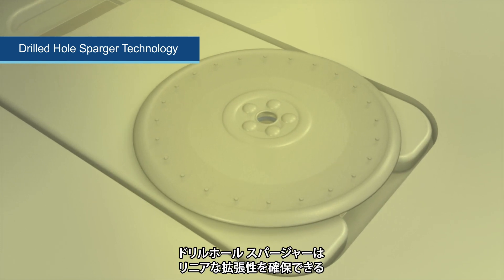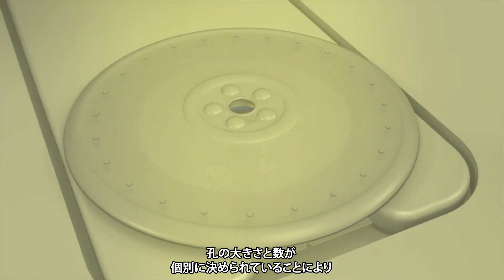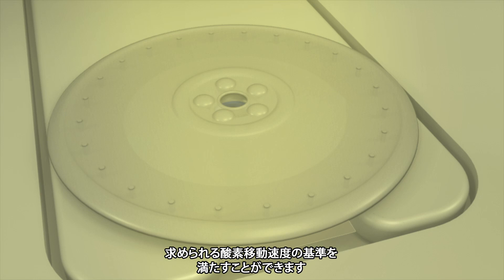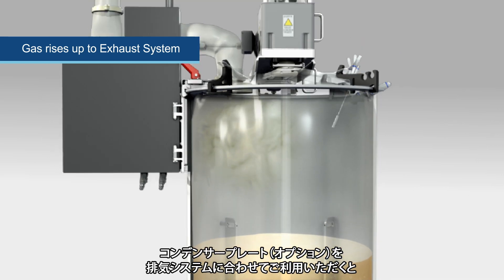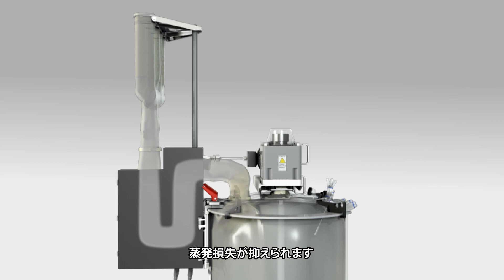The drilled hole sparger technology working with the Rushton impellers and baffles helps meet the high KLA requirements for fermentation. The drilled hole sparger pores are a specific size and quantity tailored for linear scalability to meet your oxygen transfer rate criteria when scaling from 6 to 300 liters. During operation, the exhaust system enables the correct KLA values required for microbial fermentation to be achieved.